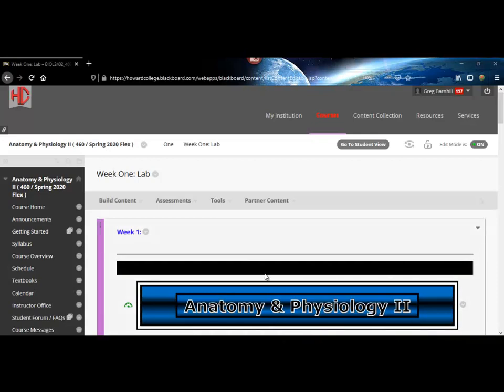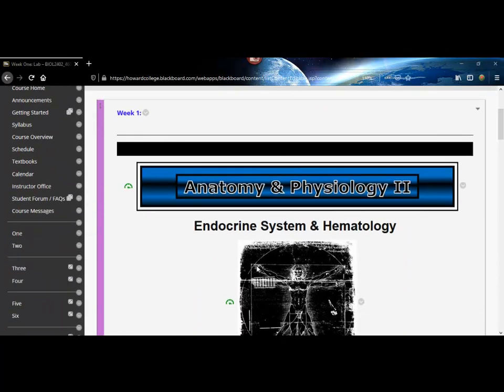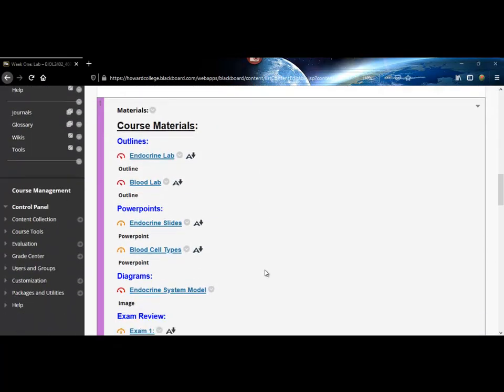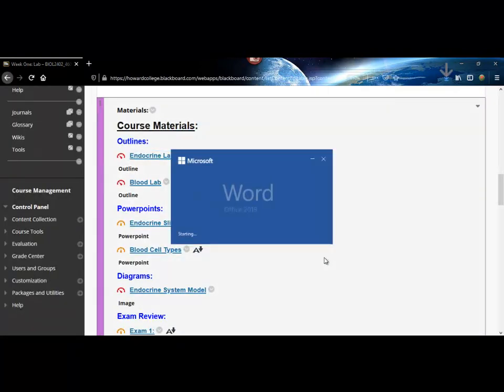All right, we are into the lab section, of course, week one lab. Sorry, I slurred that out. All right, so I'm going to do this first. We're going to do the endocrine slides. I'm going to click on our outline. This is what I would do in class.